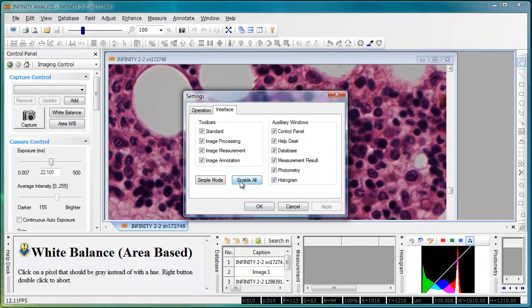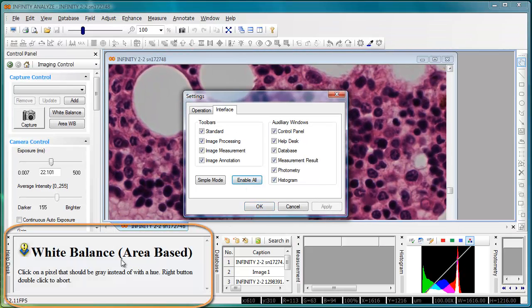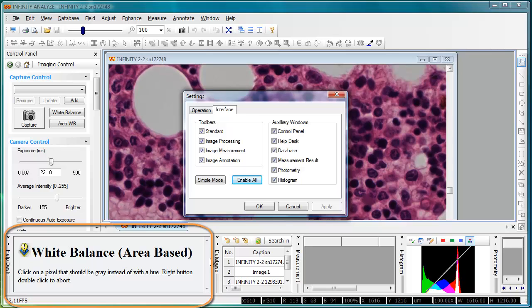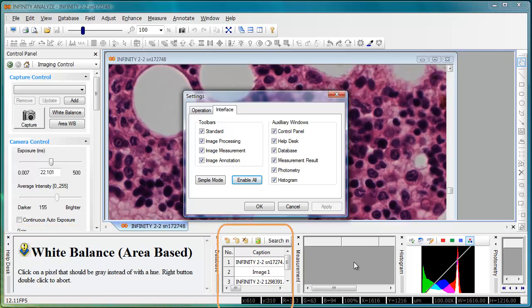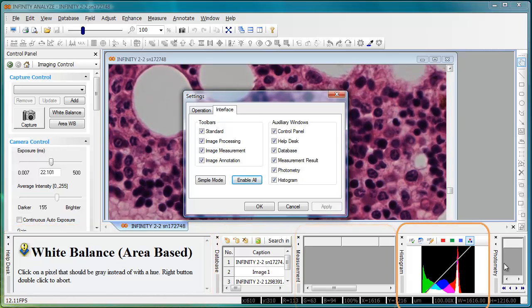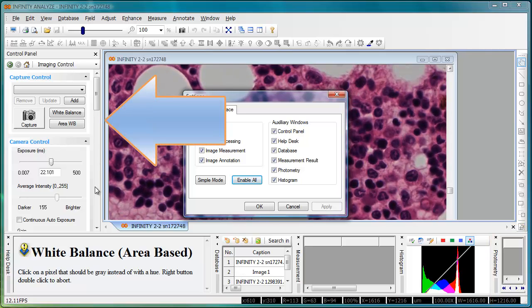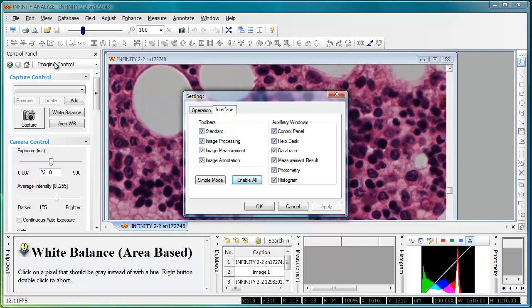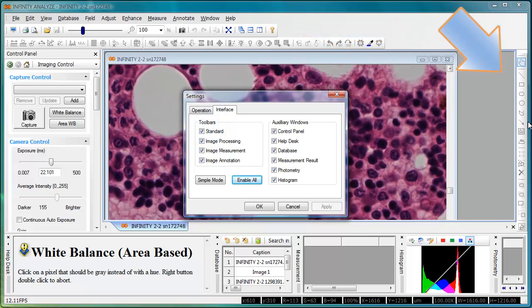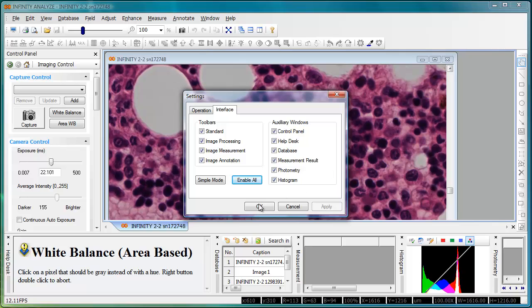By clicking on enable all, you can see that we get the help desk, database, measurement, histogram, and photometry auxiliary windows displayed at the bottom of the screen. At the same time, we've extended the display panels on the left hand side and turned on all the toolbar options across the top and on the right.